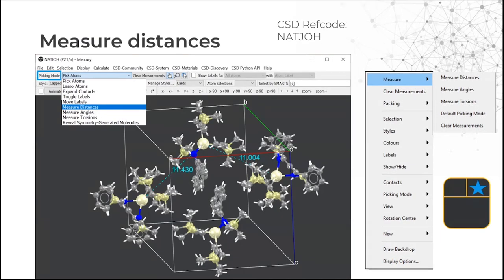Mercury also allows you to analyse structures in more detail. One simple way is to measure distances, angles and torsions. To do this, change your picking mode in the top toolbar — instead of Pick Atoms, select Measure Distances, then click the atoms you want to measure between. These can be connected or unconnected atoms. Alternatively, right-click with the mouse and go to Measure, Measure Distances.